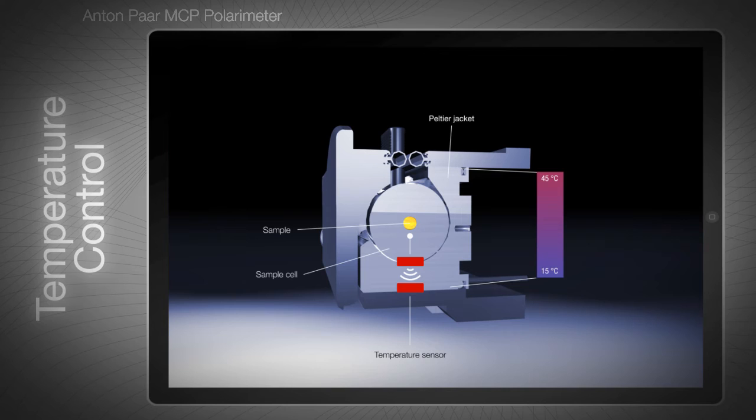Unlike external probes, the integrated sensor does not need to be cleaned after each measurement. This design prevents carry-over errors caused by dirty external probes. The integrated sensor cannot obstruct the light beam either.